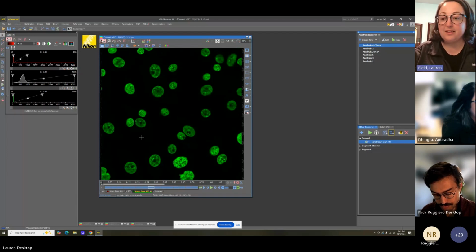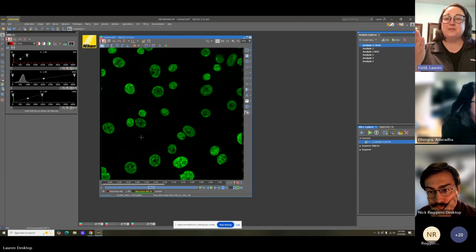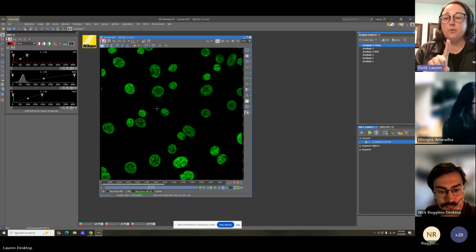This is one of the easiest algorithms to train because you take a picture and then you compare it to another picture. Enhance is going to work exactly the same way. You're going to have an image with 2 saved channels in it. One, which is the low quality image that you want enhanced to a very nice quality image. Train both of those and it will run exactly the same. It will create the enhanced picture out of the lower quality image.